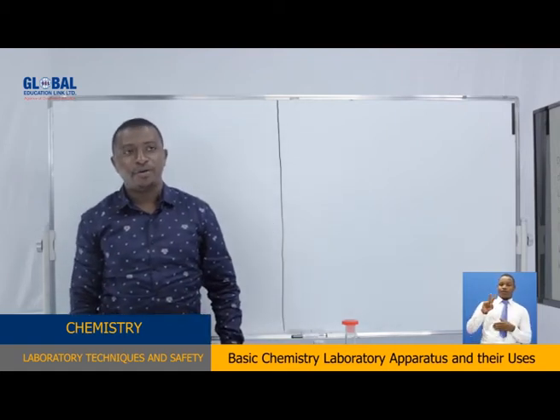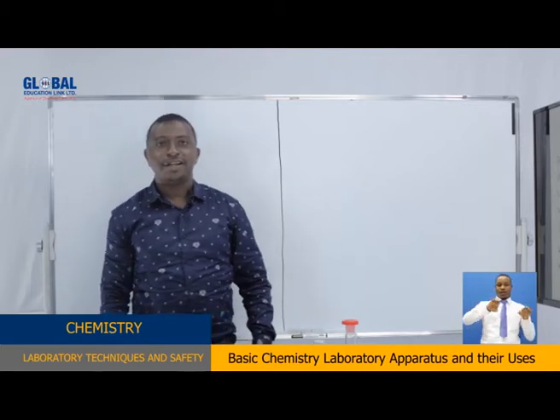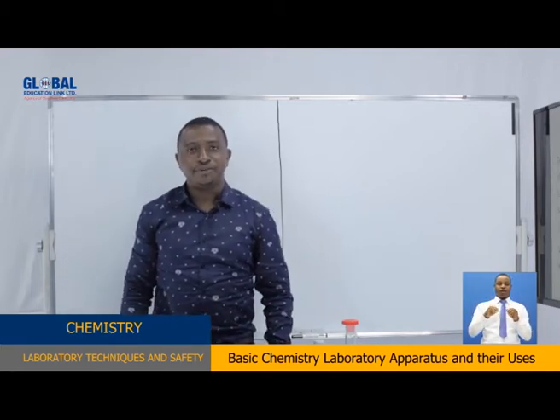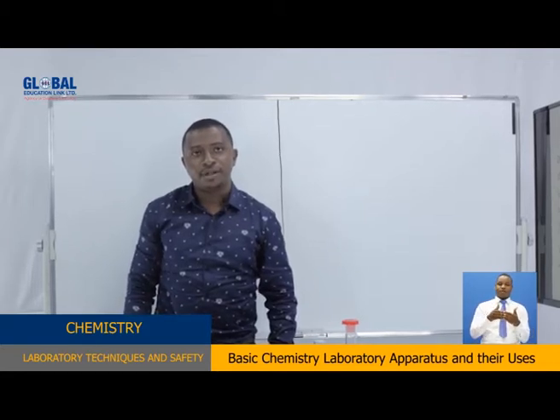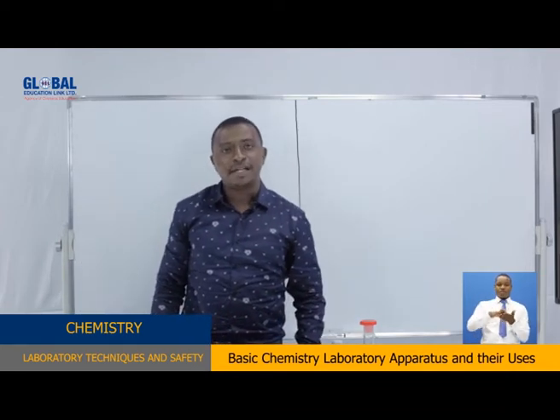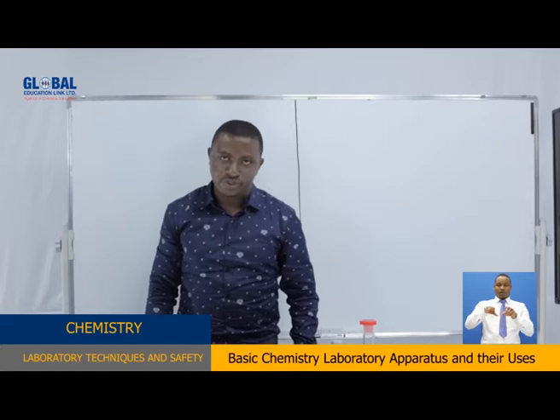I'm Mr. Novatus Gabriel Moyo, a chemistry teacher. Today I'll be teaching Form 2. I'll be specifically making a revision on a topic known as laboratory techniques and safety. And I will focus on the subtopic known as basic chemistry apparatus and their uses.